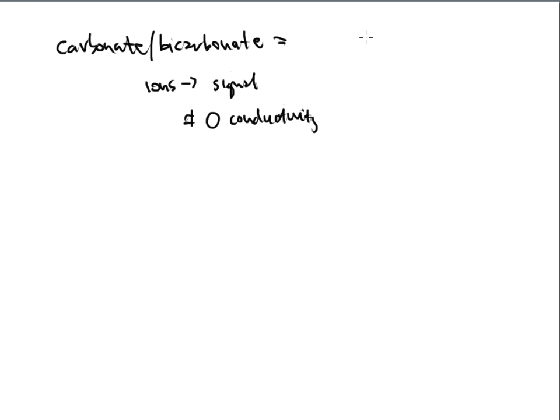What kind of conductivity range should you be looking at? And this should always be 10 to 20, what we call microsiemens, S-I-E-M-E-N-S, microsiemens per centimeter. Some people will write it microsiemens over centimeter. That means the same thing. So 10 to 20 is the range that you should always see on the software or from your instrument detection.